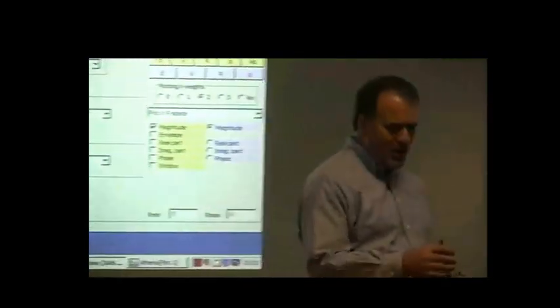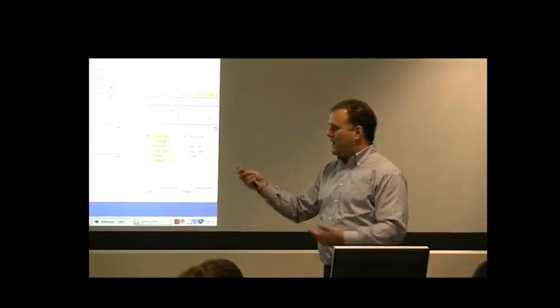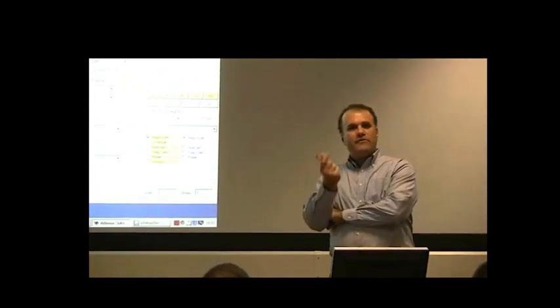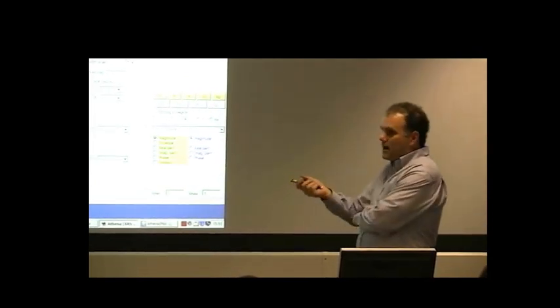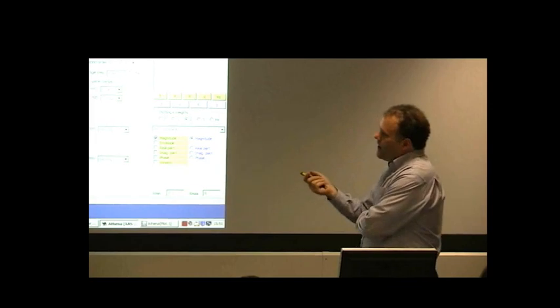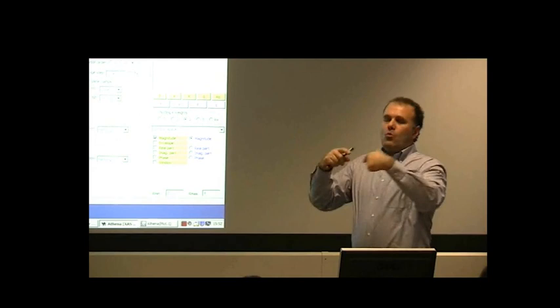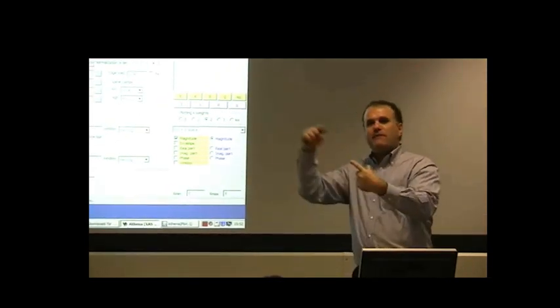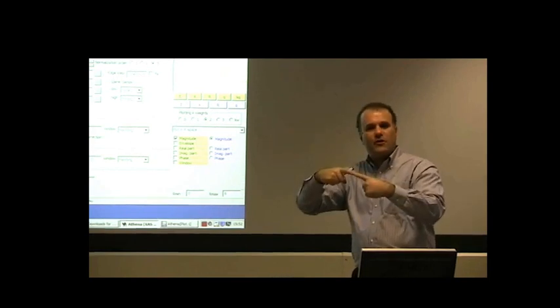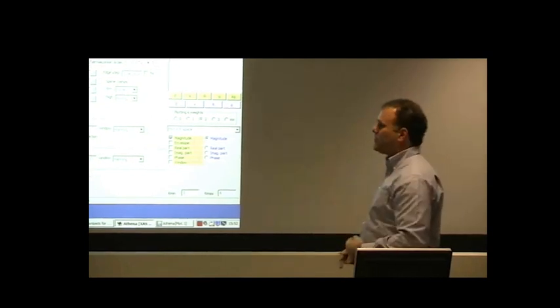The way it is implemented in IFEFIT, and therefore the way that it's implemented in Athena, is that the last 5 physical points of data in the data file have a clamp applied to them. That is, when the process is done to determine the background function by Fourier transforming and looking at the low-frequency components, the choice of spline will get a penalty if that happens.